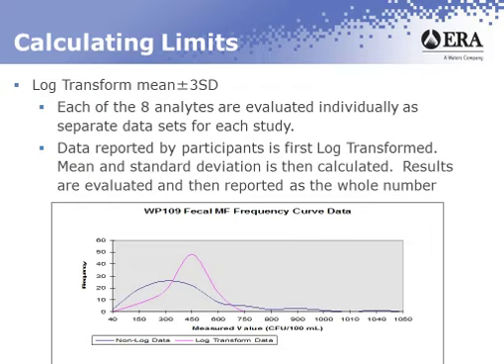Now you may be asking yourself, why would they do that? I've included a graph on this slide to try to illustrate why you want to log transform micro data. Essentially, this graph is a frequency plot. You can see 2 lines in there. One's labeled as non-log data. The other is labeled as log transformed data.